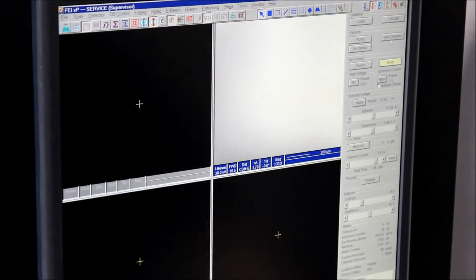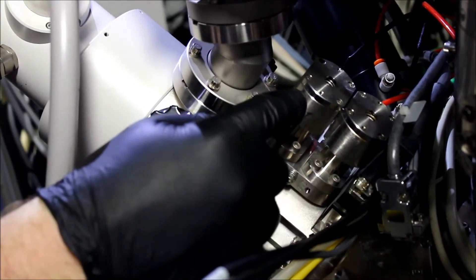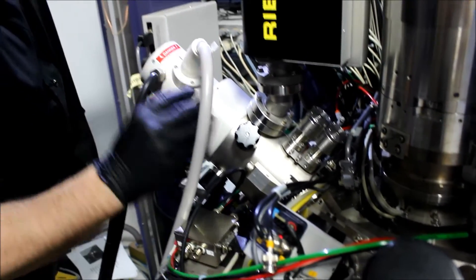Which we've already done because that takes a while. So what we did there with the software is we controlled this bypass valve to stay open while the chamber was venting. And this is the column isolation valve — this is now open, allowing this to get vented along with the rest of the chamber.